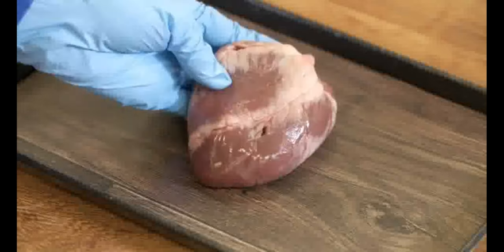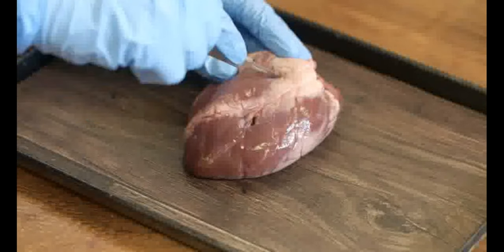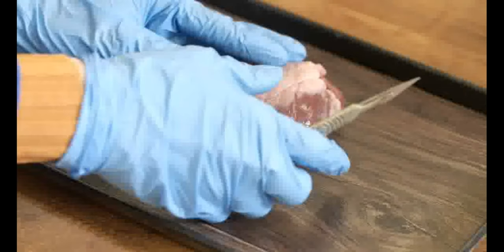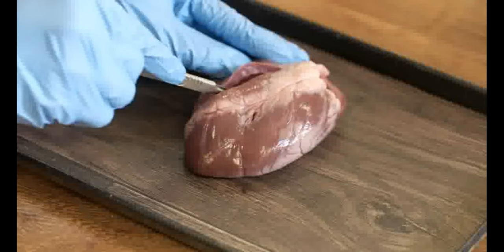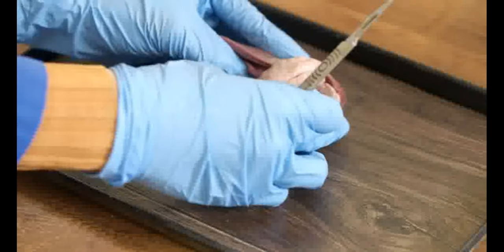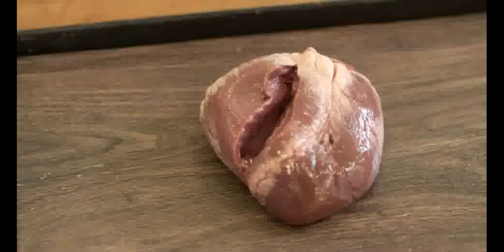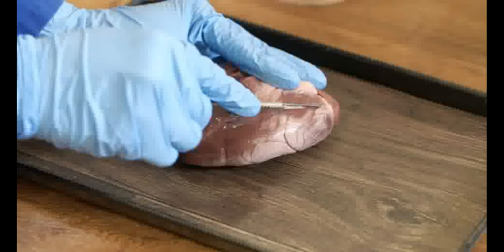Now let's look inside the heart. The muscular wall of the heart is cut from top to bottom, about 2.5cm to the left of the coronary artery. The heart is held open along the cut so that cutting can continue from the inside. The same is done for the other side, about 2.5cm to the right of the coronary artery.